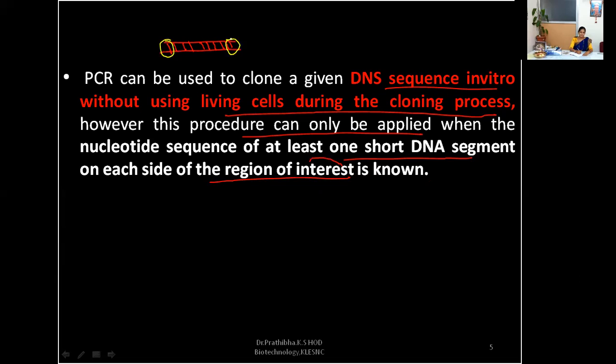So in this DNA molecule, what kind of DNA sequence is here and what kind of end sequences are there, we must know that. Otherwise, we cannot perform it.